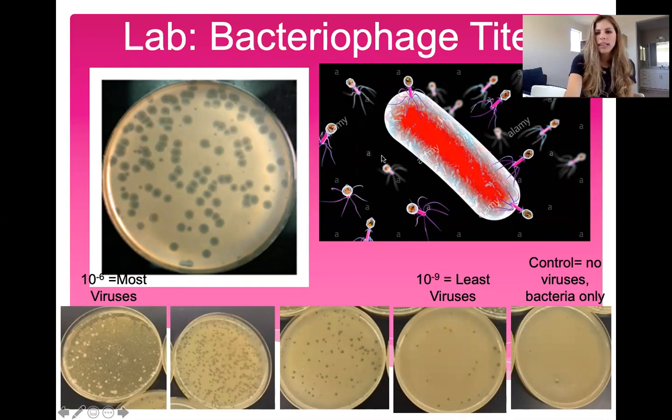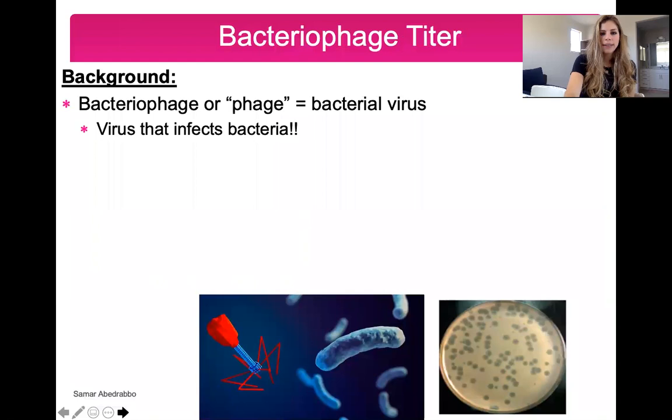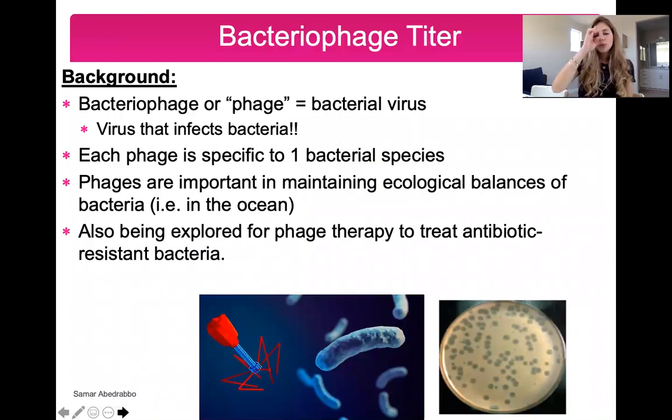This is what they look like, and here's a bacterial cell. They go on to infect a bacterial cell, and we're going to demonstrate what happens on agar plates. We will start off with a little bit of background. Phage or bacteriophage means a bacterial virus, viruses that infect bacteria. I'm going to interchange these words, and I want everyone to be familiar that phage, bacteriophage, and bacterial virus all mean the same thing.